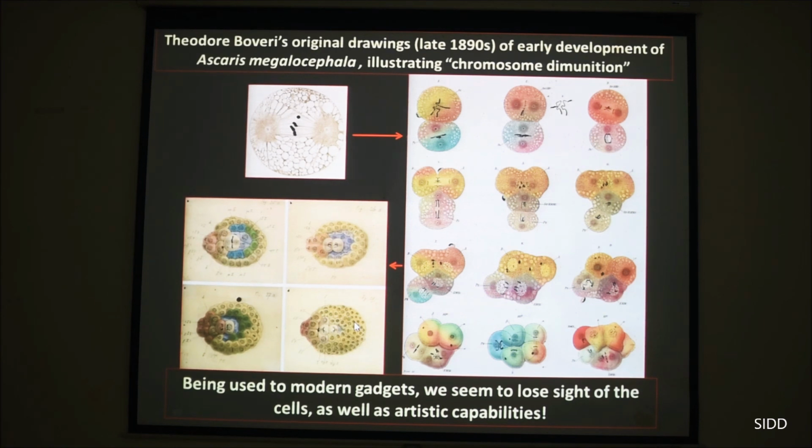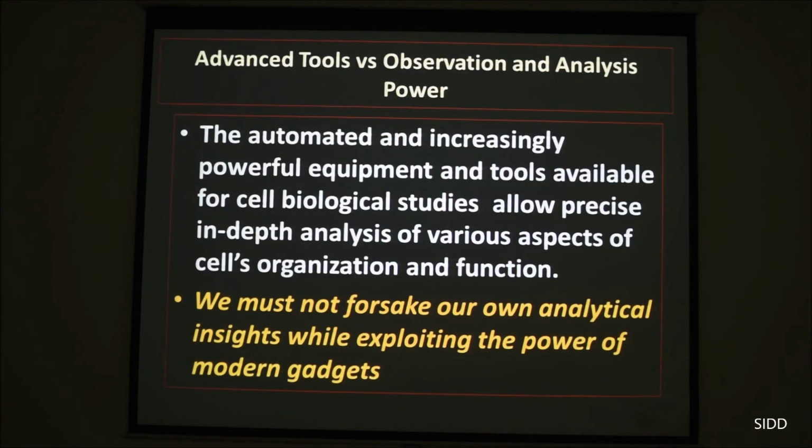If we photograph this, we won't see the details, because then we will be photographing only one level, not all the levels. But by changing focus, you can see this. Something like confocal will do today, you will get 100 sections, and then you stitch them, but you don't get all the details. And that's where the beauty of keen observation and sensitive observation, having eyes to look at beauty and look at the facts, is very critical.